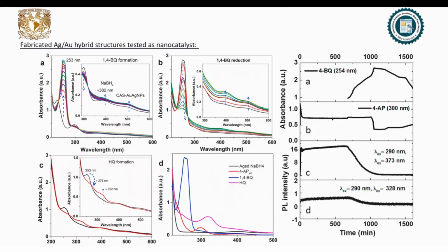Up to now, the literature said only up to 4-aminophenol. But in this study, we systematically measured how much time it takes for conversion from aminophenol to benzoquinone and benzoquinone to hydroquinone. We did it in real time, in terms of the photoluminescence study also, and the absorbance we showed up to 1500 minutes.